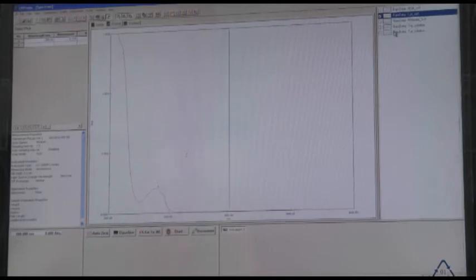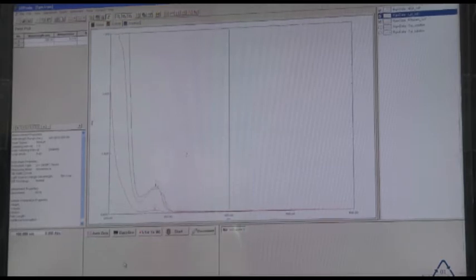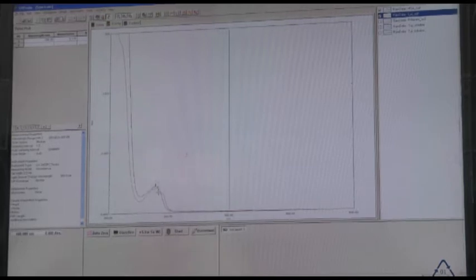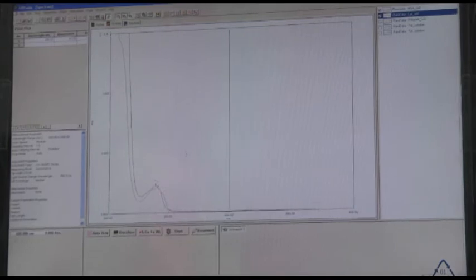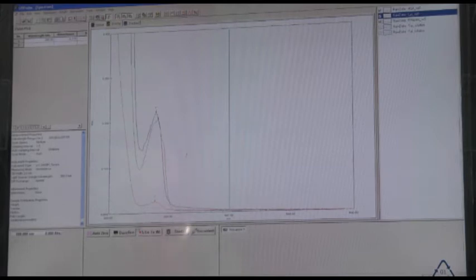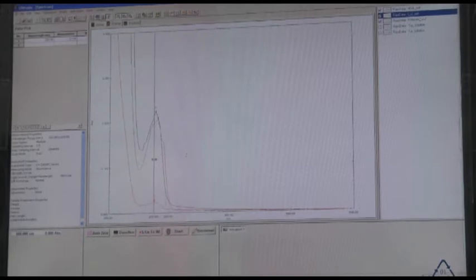We now display all three proteins — lysozyme, HSA, and RNase A — together. For lysozyme and HSA, the upper spectrum (black) is lysozyme and the lower is HSA. Adding RNase A shows three different proteins with three different absorption spectra. From these absorption spectra we can calculate concentration or determine the excitation wavelength from the lambda max value for use in fluorescence spectroscopy.